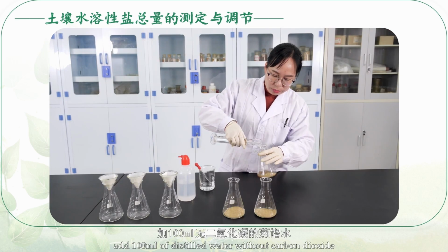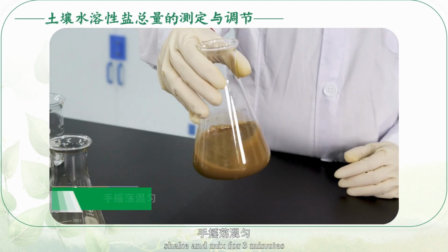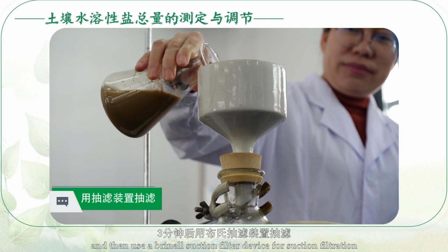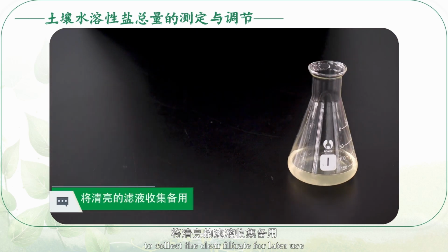Add 100 milliliter of distilled water without carbon dioxide. Shake and mix for 3 minutes. And then use a Buchner suction filter device for suction filtration to collect the clear filtrate for later use.